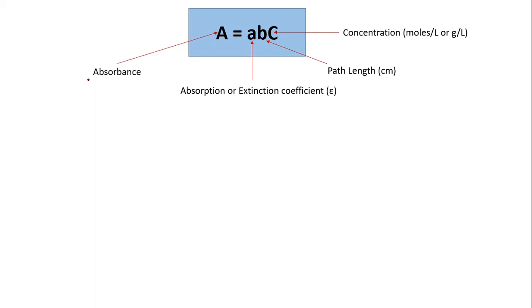No, not exactly a unit, but whenever we take the absorbance on the colorimeter, we write it as like point something of OD. But it cannot have a unit because it's a coefficient. No, coefficient is different. I'm not talking about small a, I'm talking about absorbance, capital A. Absorption coefficient has a unit and we'll discuss that. It's not a rule that a coefficient doesn't have a unit.